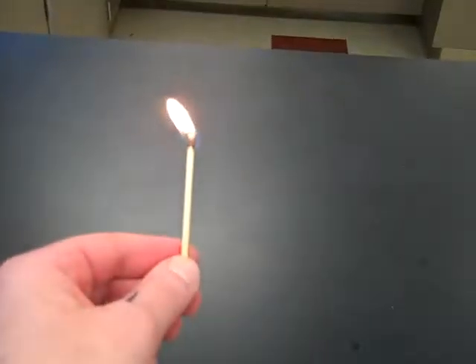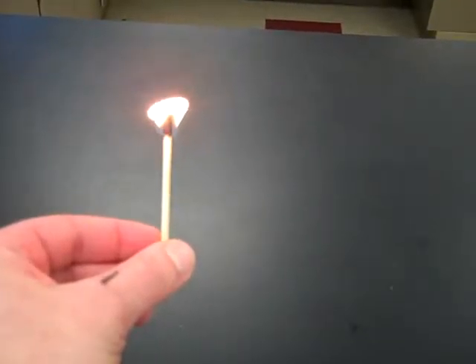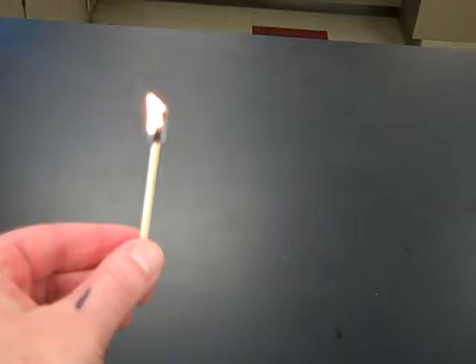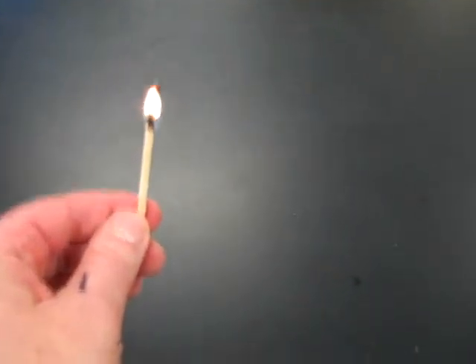Okay, for station 6, we will be lighting a match and assessing whether lighting a match is a physical or chemical change. Give me one moment, I'll light the match. Alright, here is our burning match. Again, is this process an example of a physical or a chemical change?